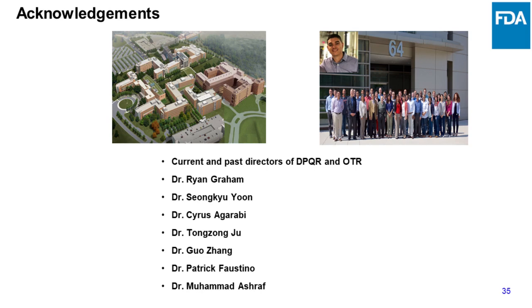Thank you, I think it's a great question. As you saw in my presentation, our ranges for the analytical method were, for example, 10 to 500. So we have a wide range, and mostly I would just change my dilution factor. I have seen so many culture media, but I have not changed the method. The three methods we've developed so far cover almost all the metals, unless the metal is changed, then obviously you have to make a new method. But if the metal is the same, I just change the dilution factor.